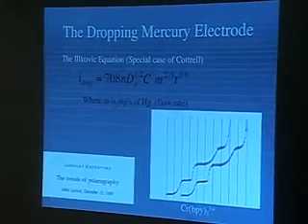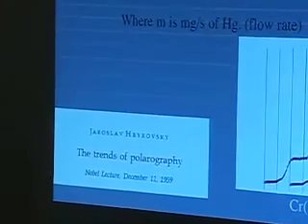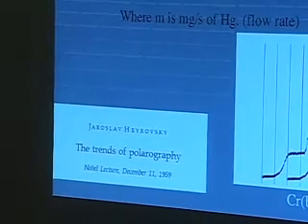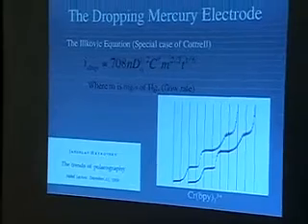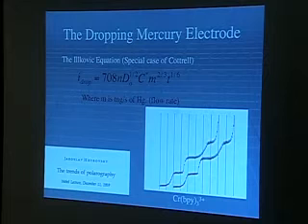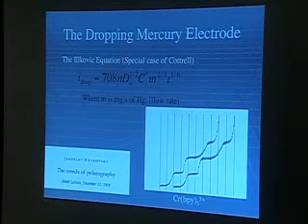What's interesting about this address is it's amazing how this guy did this. This is work done in the 40s, right? And his quote-unquote potentiostat is nothing like you would conceive of today. His recording medium is a drum all geared up the right way with large gears and whatnot. So he's got a time-dependent baseline, much like the seismic recordings done on a drum. You guys have all seen that, right? So he had something like that going.